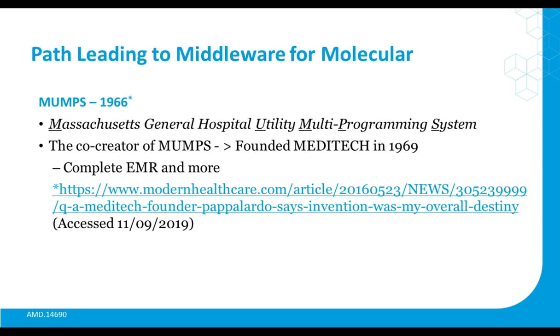In my opinion, the advent of MUMPS was really the sentinel event that got us where we are today with the use of logical programs in the hospital lab space.